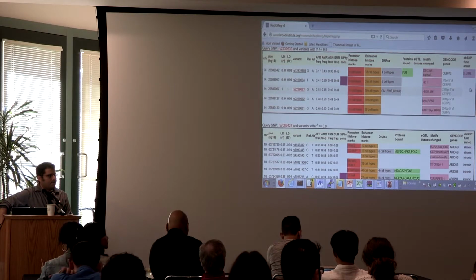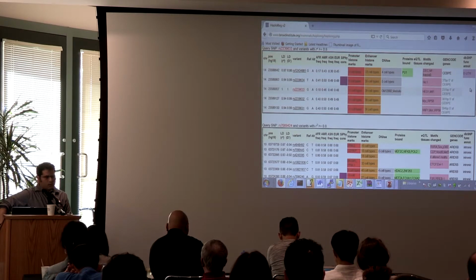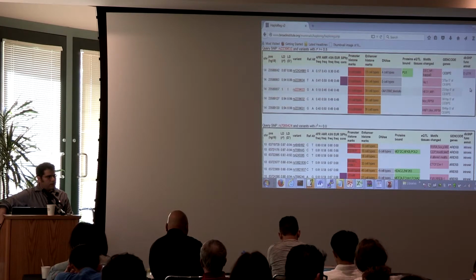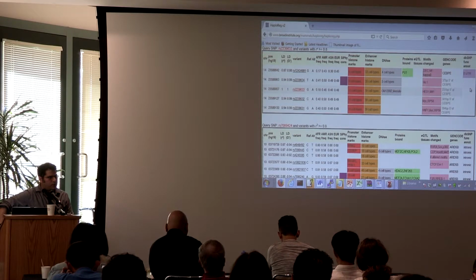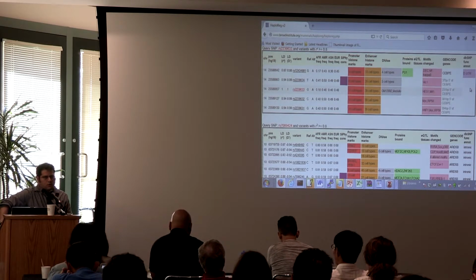Is it possible to specify genes of interest, or do you have to extract the chromosome regions yourself? So in this tool, you specify SNPs. It's based on SNPs. And then it'll use the population data to expand that out to other SNPs based on linkage disequilibrium. Is it possible to input a SNP, but the enhancer histone mark is missing, with no result?